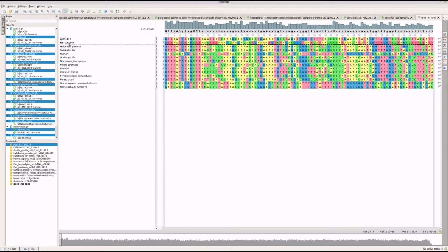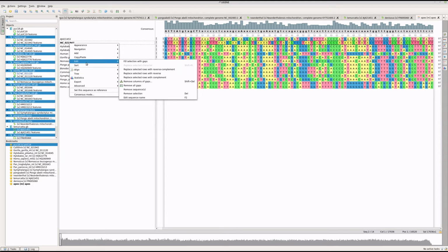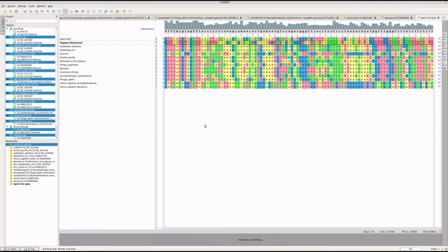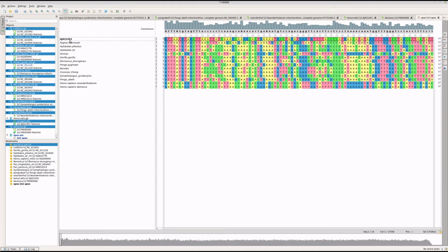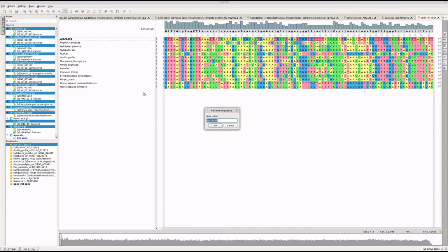And 42 is, that's the pygmy marmoset. So we're just gonna write pygmy marmoset, right? And then what's this AJ45? AJ45. So that's this lemur. Okay, so that's the other outgroup. That's the other negative control, right? So lemur, what is it, kata, right?